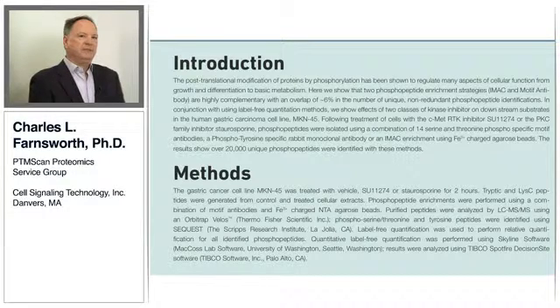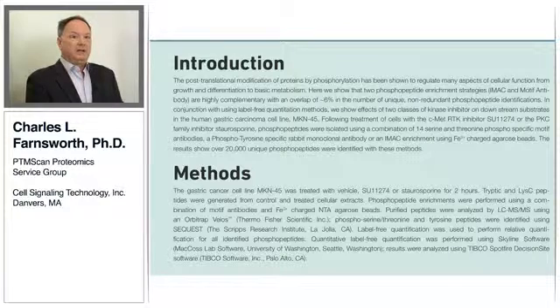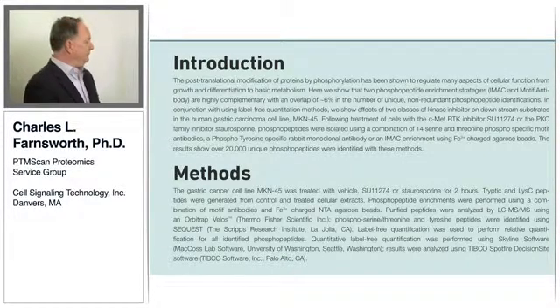The data I'd like to present today involves two enrichment methods for phosphopeptides. The first is the use of phosphospecific antibodies, alone or in combination, and with the metal affinity chromatography called IMAC.